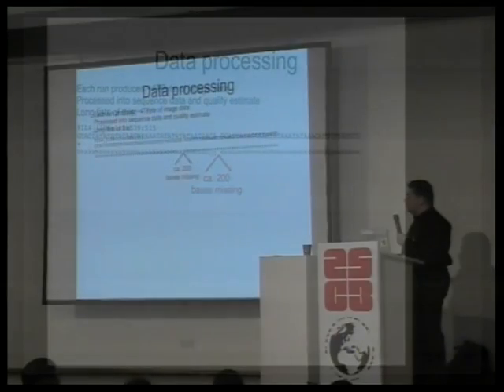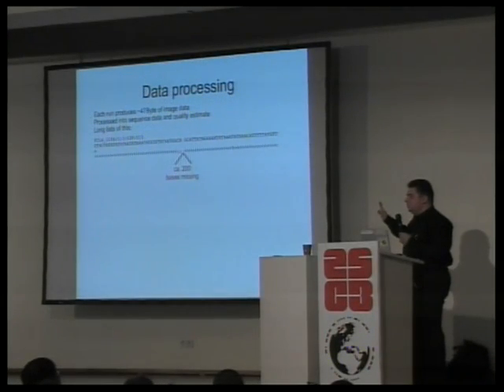And the output that I see, so I'm not working with the sequencing machines themselves, I work with the primary output, which is long lists of these data sets. So these 4 lines represent one of these fragments that were amplified and then sequenced. So this is an individual name.